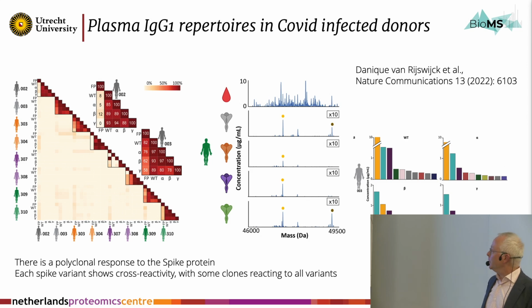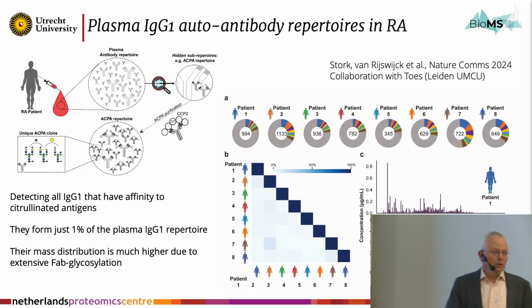And maybe it would have been the one that is really cross-reactive against any variants, and that maybe also is very good in neutralizing the virus, which we don't study here. But the message I want to get across: all of us react differently. We all make antibodies. They all bind against the pathogen, neutralize the virus, hopefully, but we all do this in a slightly different way. Now, we can go wild, because this was antibodies against spike, but we can fish for any antibody response.